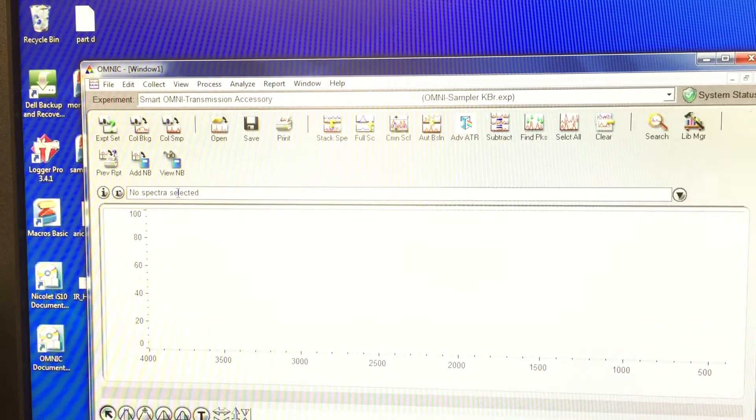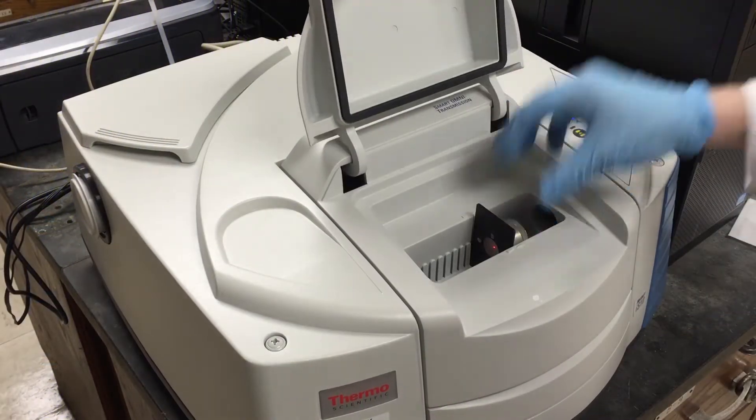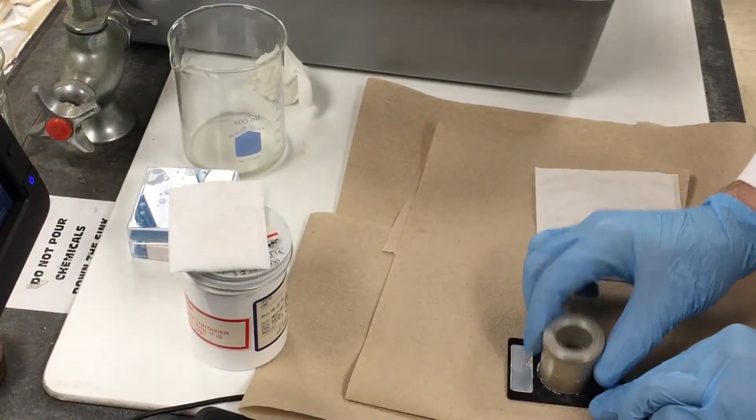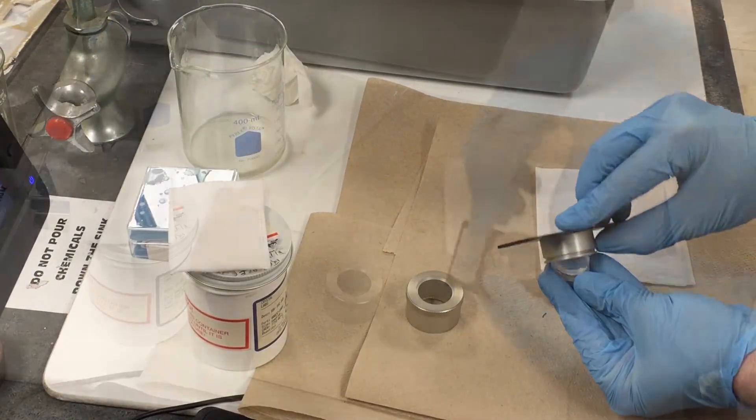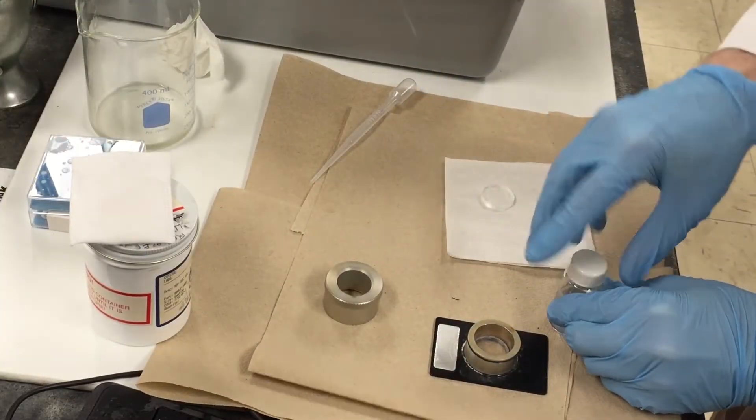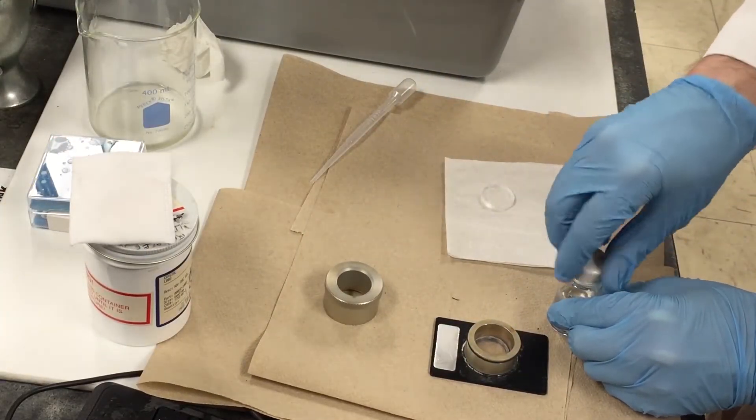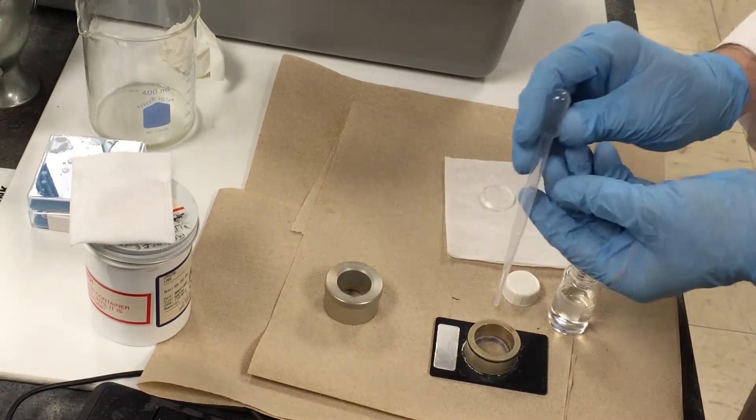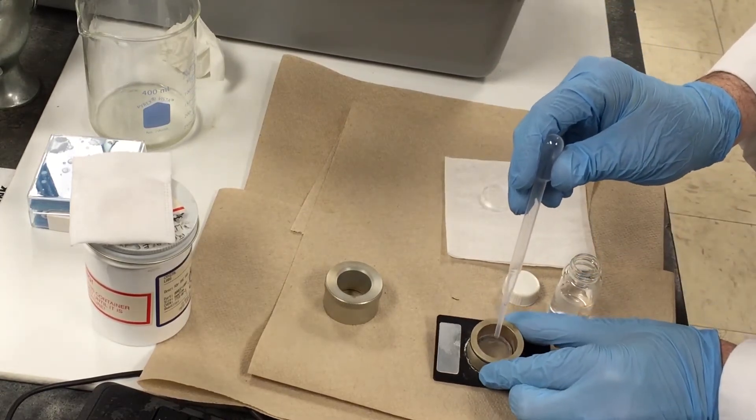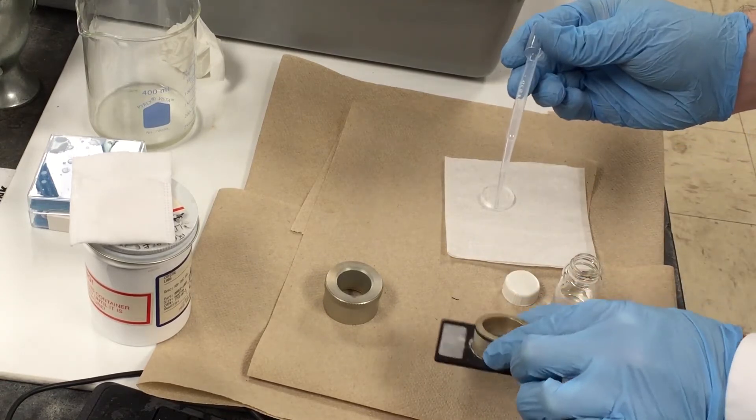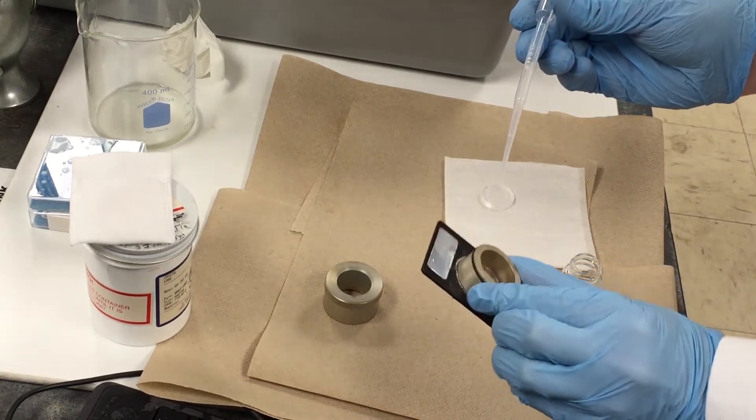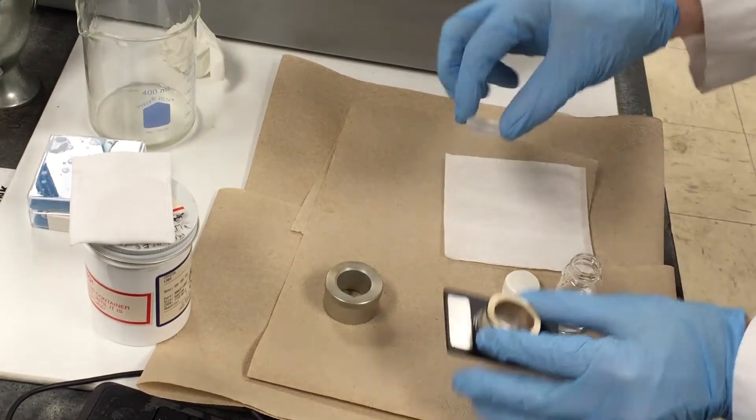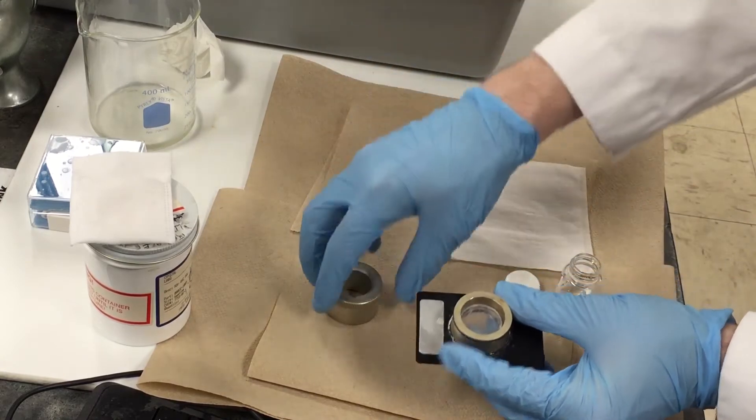Now you're ready to run the sample by sandwiching it between these two salt plates. Remove the top salt plate from the holder and place it on a fresh kim wipe. If your sample is a liquid, simply place one or two drops onto the bottom salt plate. Cover with the other salt plate and close the holder, being careful not to apply too much pressure.